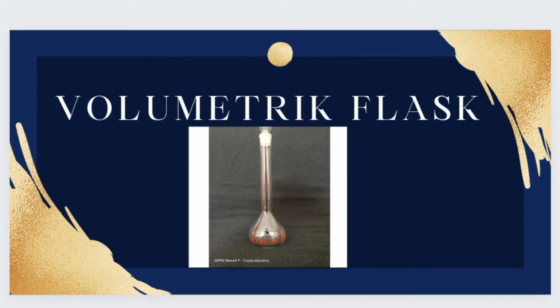Okay, next is the volumetric flask. Volumetric flask is one of the laboratory equipment used in the process of making or diluting a solution. This tool is usually used to obtain a solution of a certain substance which will only be used in limited size as a sample using a pipette.